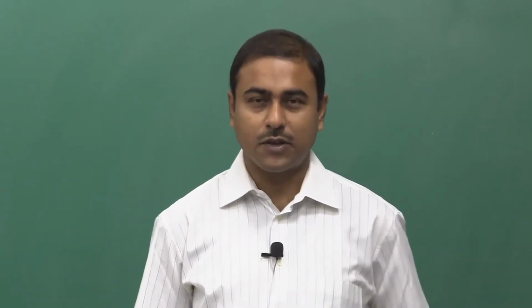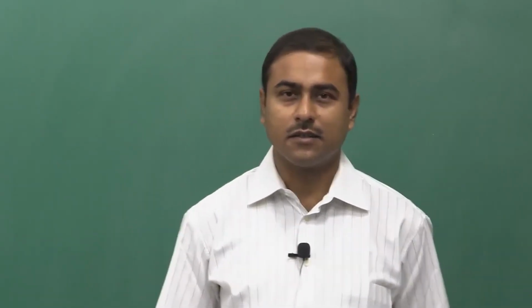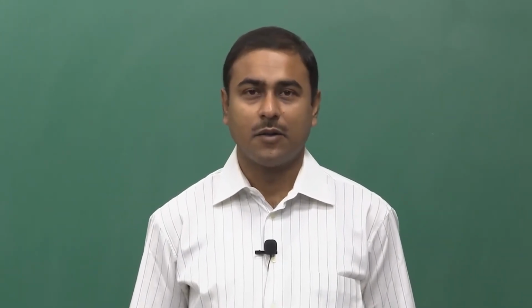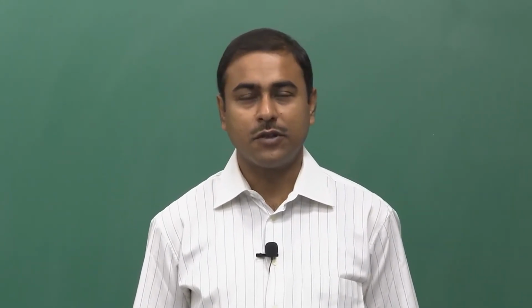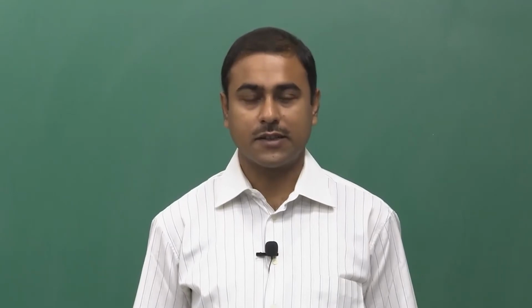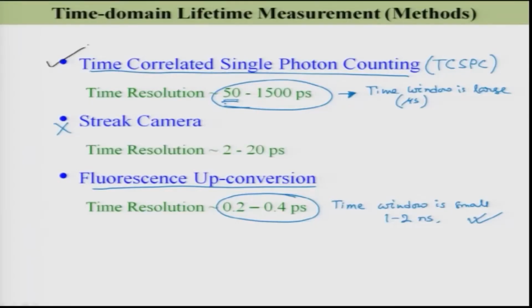So, till last class what we were discussing is the time correlated single photon counting setup, and I already mentioned to you that we are going to discuss two types of methods for the lifetime measurement. The first one, which I have already discussed, is this time correlated single photon counting, and probably by now you have a fair idea about the principle of this system and how it works. So, now we are going to discuss the fluorescence upconversion.